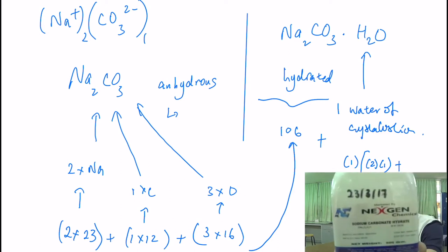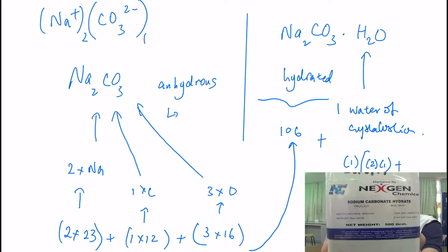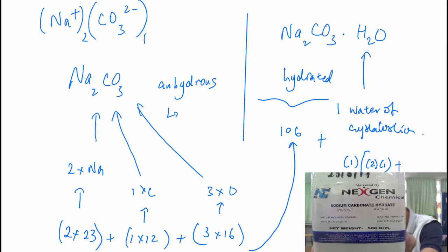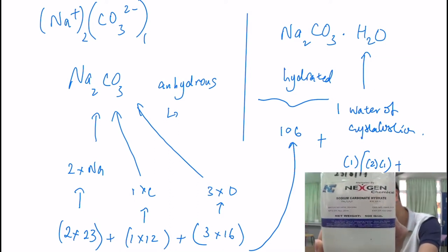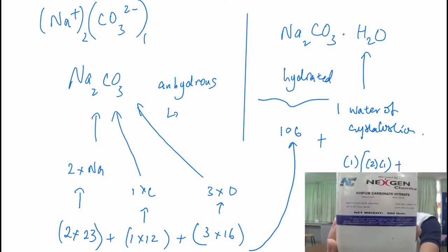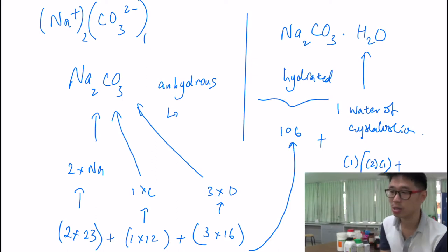As you could see, with 1 water of crystallization, so sodium carbonate, Na2CO3.1H2O, the molecular mass as shown on the bottle itself, straight from the chemical producer, is 124.00. There's just higher level accuracy based on their periodic table. I have just used a very basic, a very primitive periodic table in terms of O-level and IGCSE level accuracy to the nearest whole number, okay?